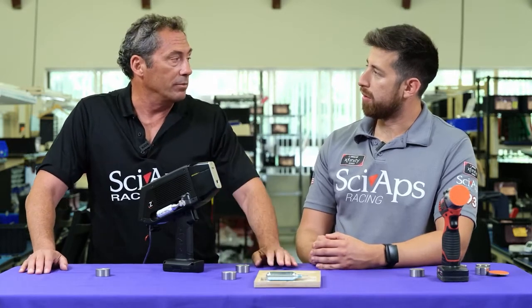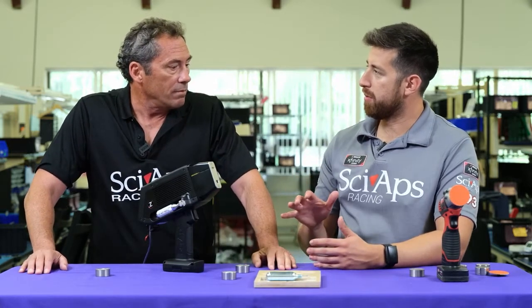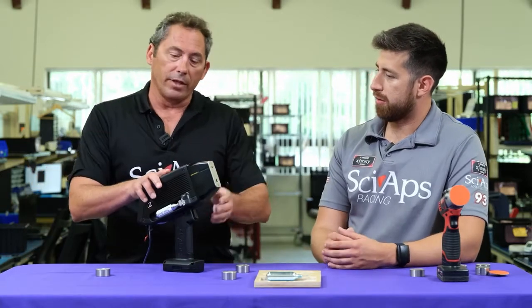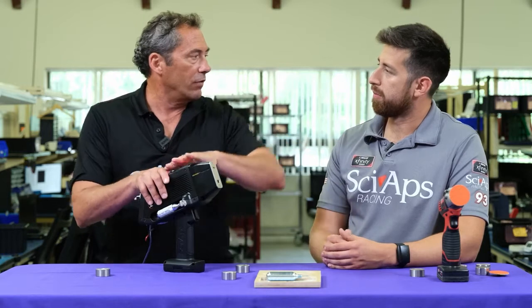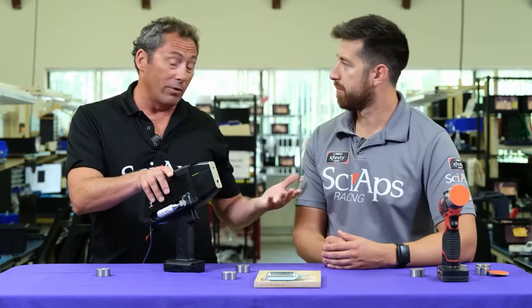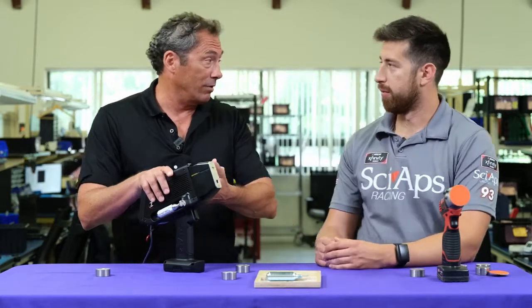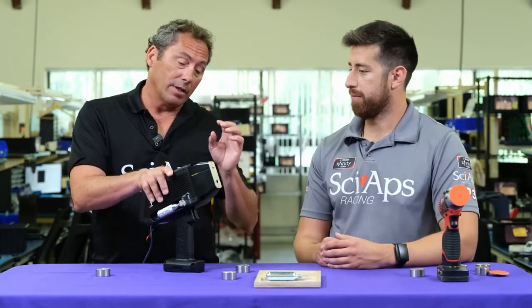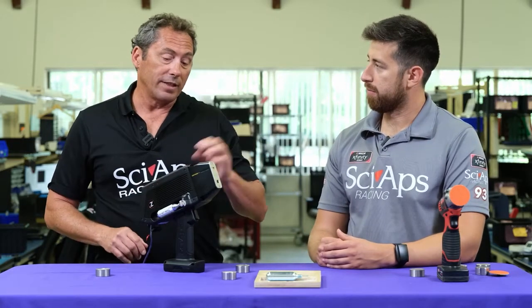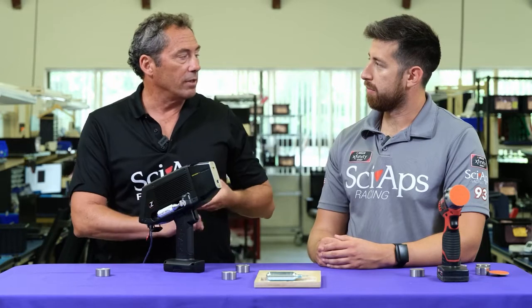For carbon, X-ray just doesn't measure it, so you have to go to an optical technology like LIBS. And if they only need to measure carbon, we've come out with another unit — the sister to this unit — called the CSI. CSI stands for Carbon Silicon. It's a smaller unit, only about three and a half pounds, and it only measures carbon and silicon.